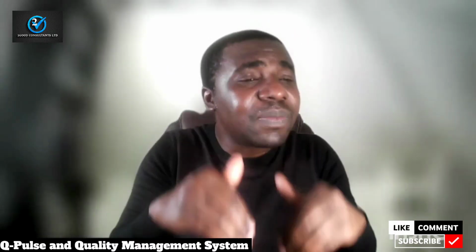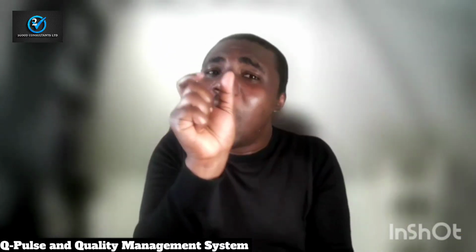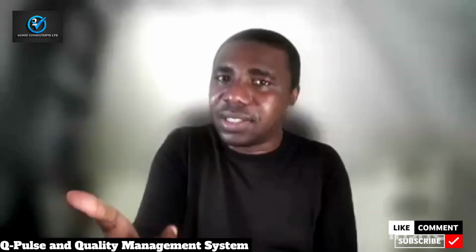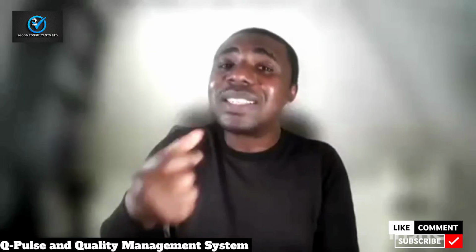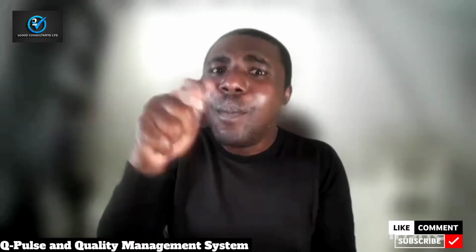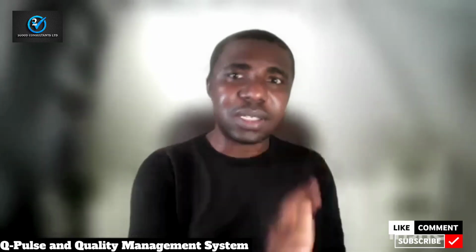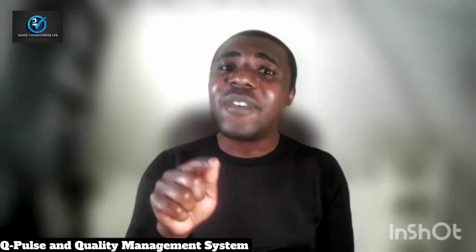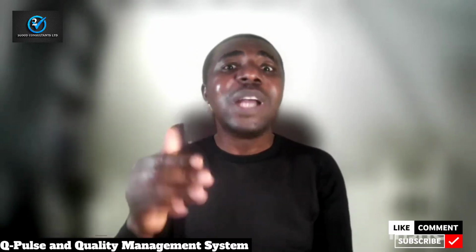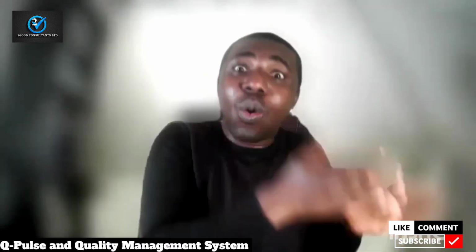And the reason why I'm saying this is because, remember, don't remove your eye from the electronic device. Everything about accreditation, or most things about accreditation, has to do with documentation. We must have a way to trace that we have done this. We must have a way to trace that we have not done this. We must have a way to trace that this is what it used to be, and this is now what it is.